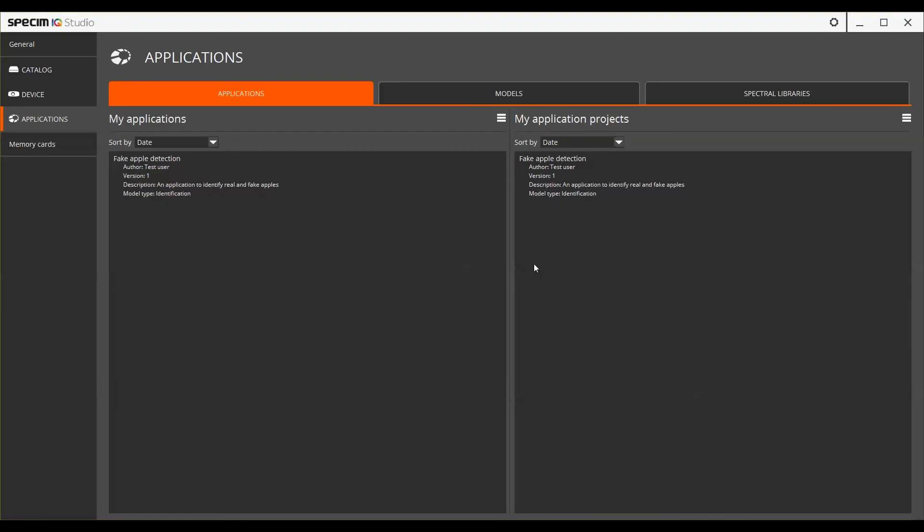As soon as you connect either of the previous, the usable memory card is listed under the memory cards. To examine and import the recorded data, the targeted memory card can be selected.